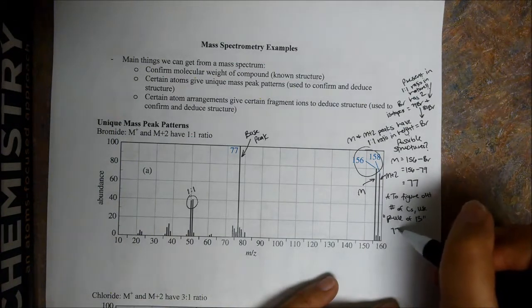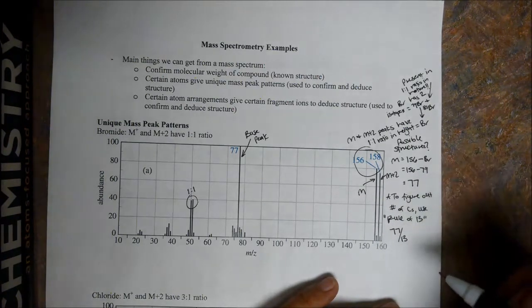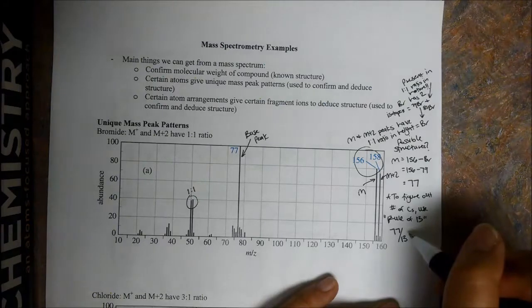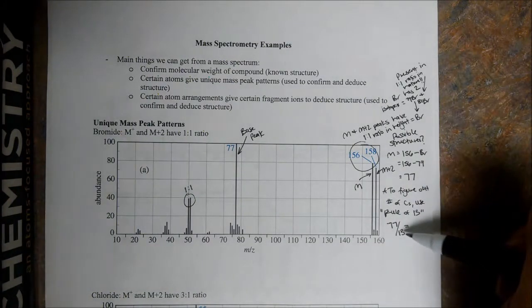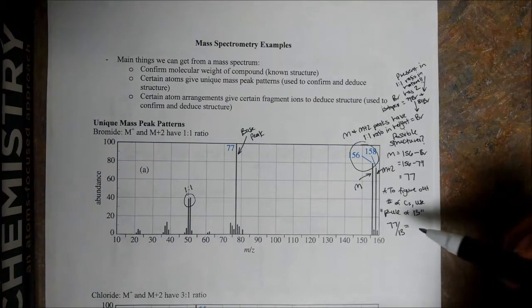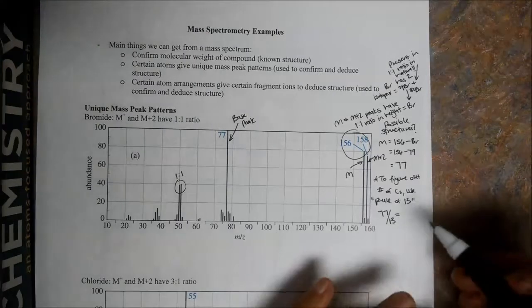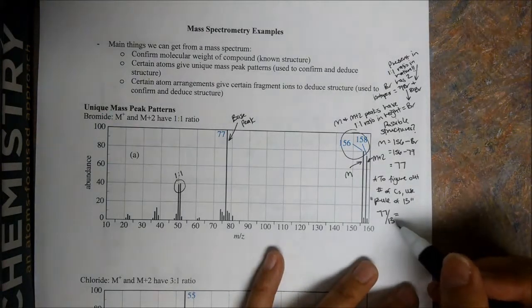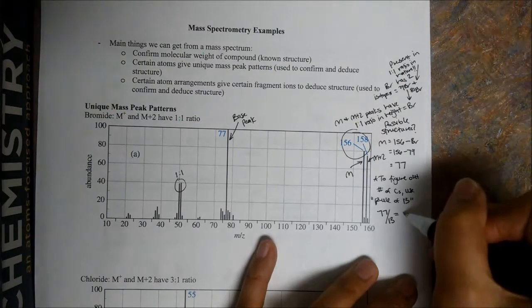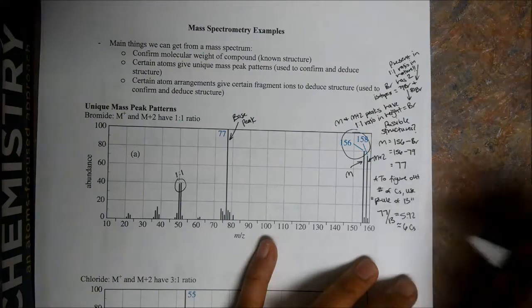The number that comes out is usually the number of carbons that are possibly in your sample. We use the number 13 because it corresponds to CH groups. C is 12, hydrogen is 1. So if we use 13, it just gives us a rough estimate of the number of carbons that could be in our sample. If we do this, we get 5.92, which is about 6 carbons.